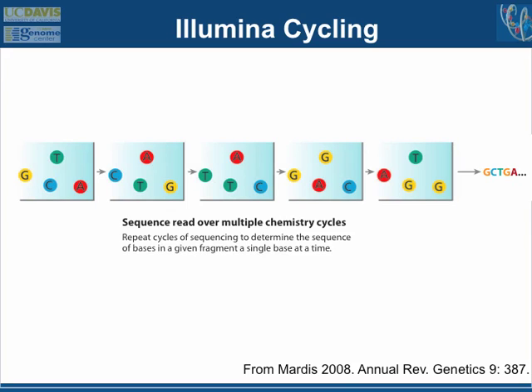In the original development of the Illumina method, this cycling reaction and the scanning of the slide and finding the clusters was very slow. So you could generate about 10 nucleotides a day, maybe, with the machine. So if you wanted 50 base pair reads, it would take 5 days to run the machine. If you wanted 100 base pair reads, again, you're getting into weeks of time on the machine to get longer reads. It turns out that the method originally as it was developed couldn't read much longer than 90 or so bases anyway, but even those 90 bases took weeks to generate in many cases.